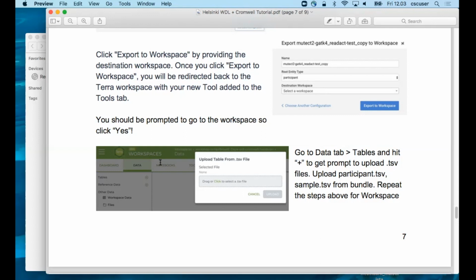Yeah, open. And check this box. Upload. Folder, yeah. Okay, so there's your file. Slower? Okay, sounds good. Yeah, okay, I'll go a little slower.